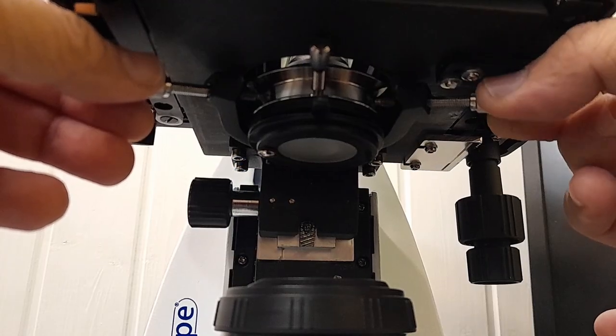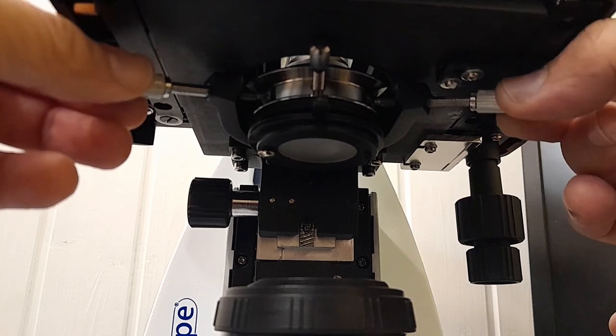The condenser of the B-Scope also has two centering screws, so you're able to align the condenser properly with the illumination system. You can raise and lower the condenser, and there is also a condenser aperture diaphragm that you can open and close. On the back of the microscope there is a cable management system so you can wrap around any excess cable so it's not occupying desk space. The main switch is on the back as well, and there is a slot for a Kensington lock so you can attach a lock and tie the microscope down for security.